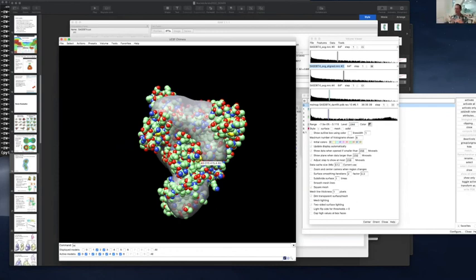You can go into PyMol. I've got tutorials on my website on how to get these nice colored volumetric maps. And you go in there and you set the sigmas that you want. You would set like 1, 5, 10, 20, something like that, or 1, 5, 7, 8, 10, or something like that. And as long as you put in the caption of your figure what sigma values you are using, that's fine. That's exactly what they do in crystallography, right? This map is contoured at 1.5 sigma or something. This map is contoured, in this case, at 8 sigma. So we typically have higher sigma values here in SAXS because it's lower resolution.